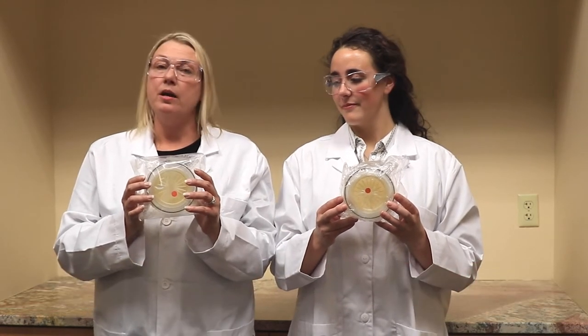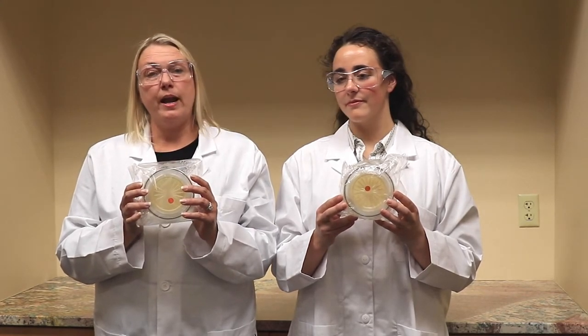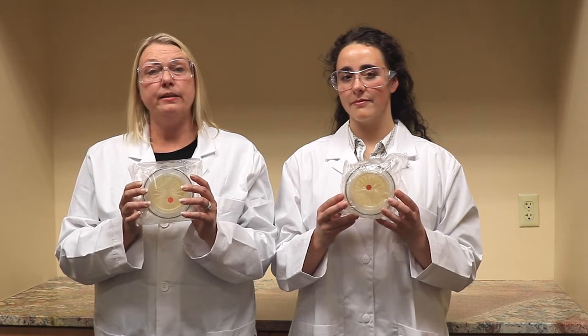Hi, I'm Heather Mason with Particle Measuring Systems and this is Lexi Lake with Particle Measuring Systems. Today we're going to talk about BioCap Single Use, the complete solution for your grade A, B, C, and D clean rooms.